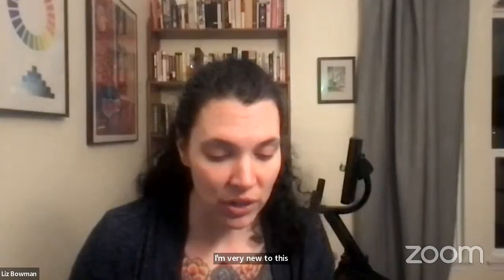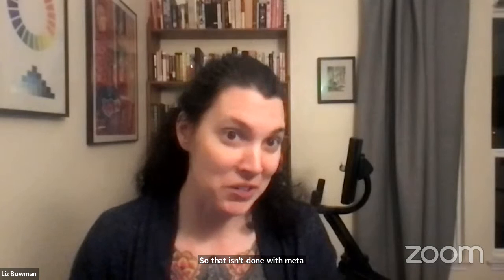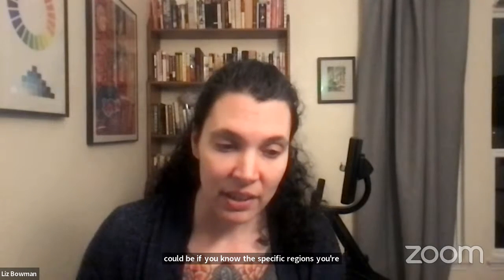So Josh asks, how would I best go about finding all the compounds in Gymnopus luteofolius? Is that done with HPLC testing or barcoding? I'm very new to this. Okay, so you want to look at the metabolome. So what type of secondary metabolites, what type of chemicals are produced? That isn't done with metabarcoding. I guess it could be if you know the specific regions you're looking for, but usually you don't.